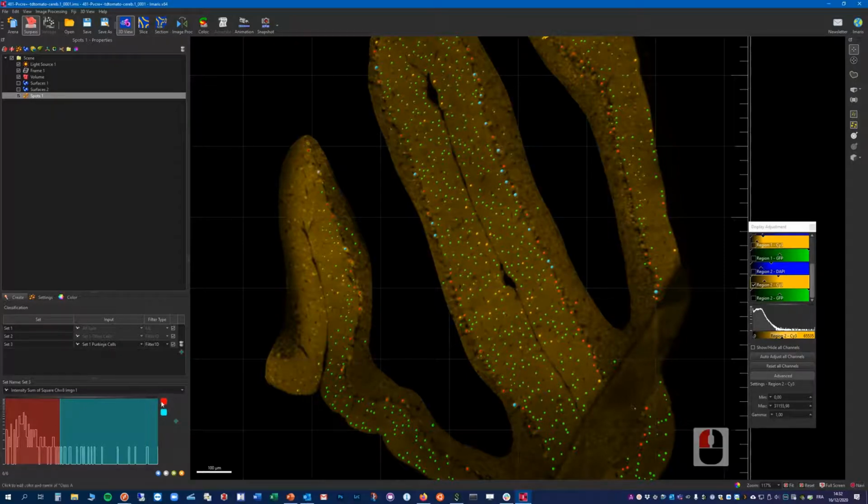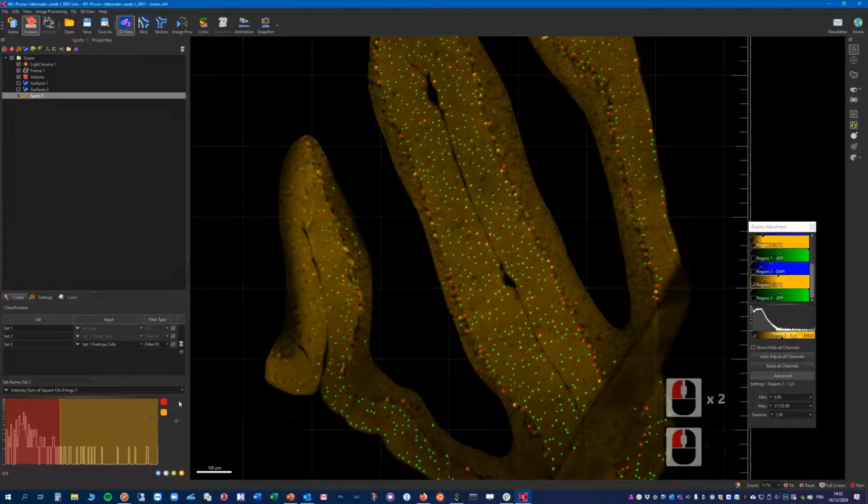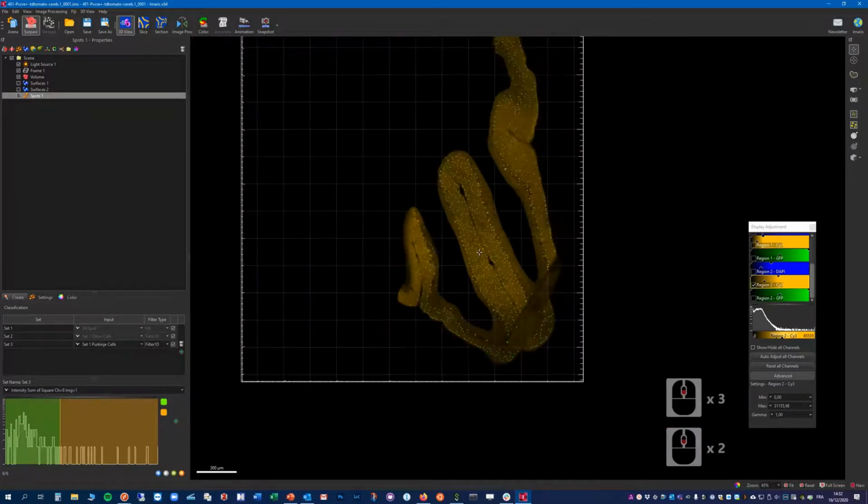And so this will be yellow negative, and this one yellow positive. And we can also put them in, let's say, something more like this, orange, and the other, let's say, kind of yellowish green, something like this. So it's looking similar to the rest.